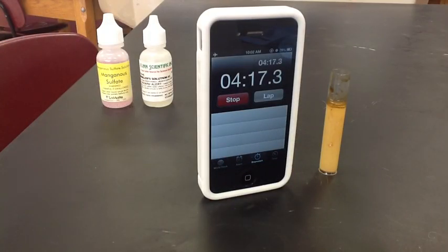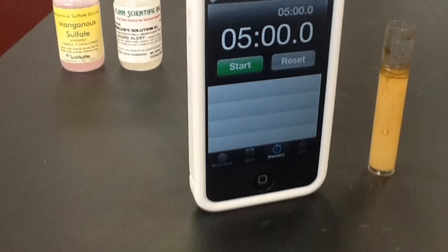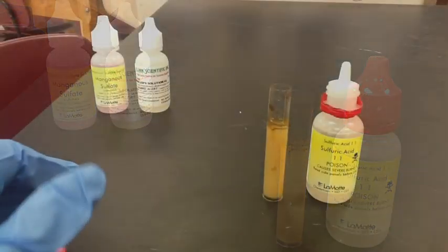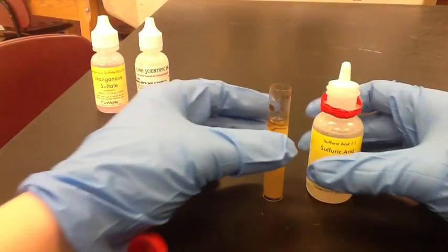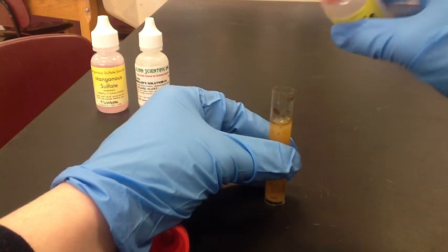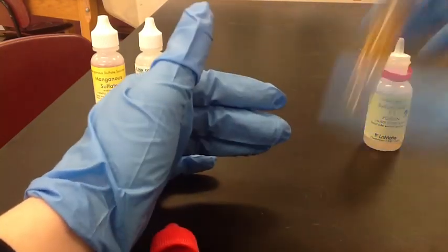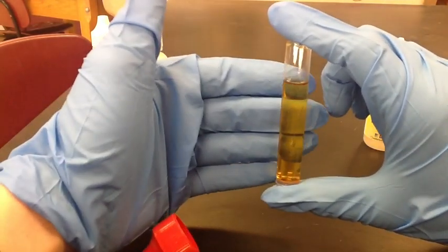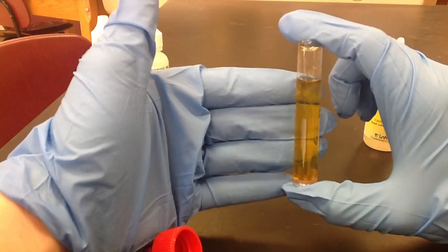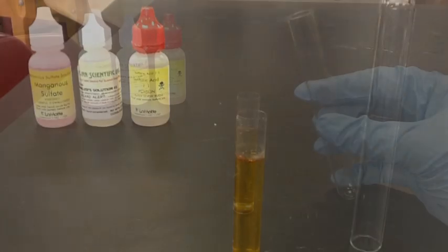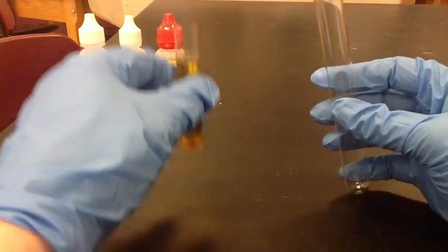Now I allow the precipitate to settle for five minutes. As you can see, as time is passing the water is becoming clearer and the precipitate is settling. Now I will add eight drops of sulfuric acid, and then cap and mix. As you can see the water is now a pale, bright yellow.